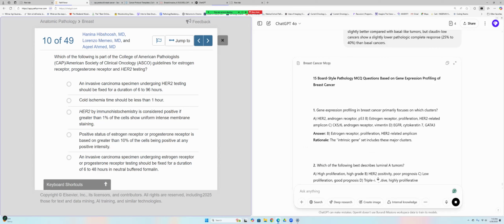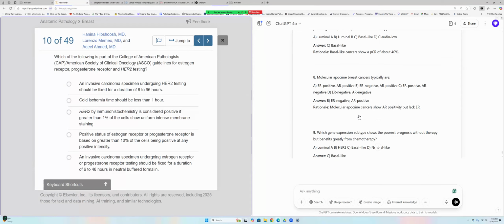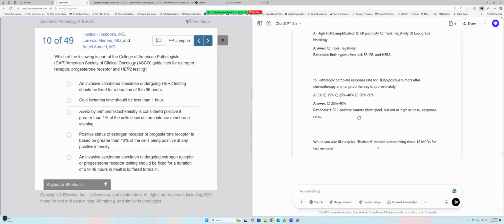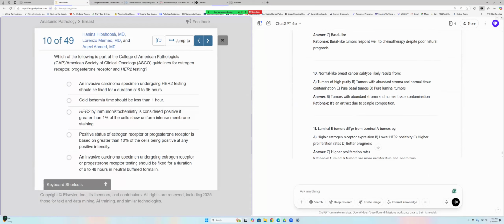You know that in my program, for every breast cancer, we must make sure it enters formalin within 1 hour of removal from the body. Call it the cold ischemic time. Do you normally do breast cancer surgeries in your center? Yeah, they do. Do they have any agreement with the lab to put the breast cancer in formalin immediately after they remove it?